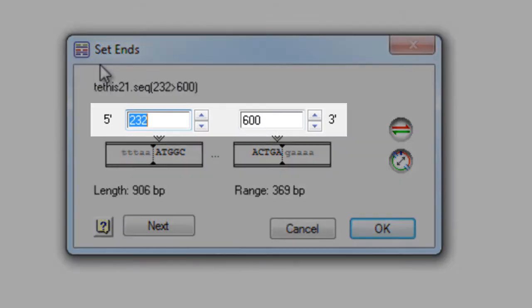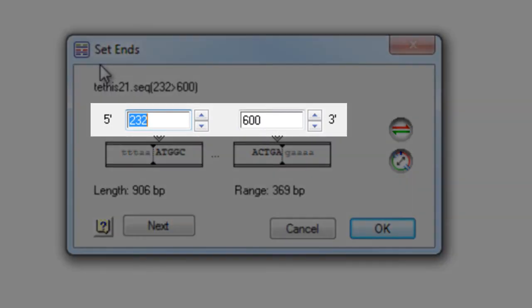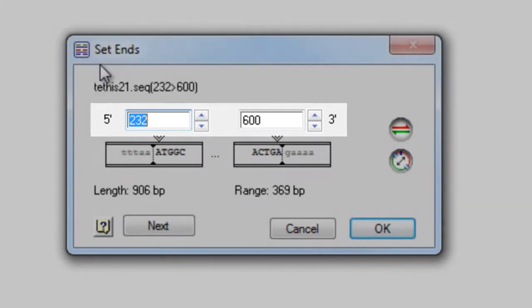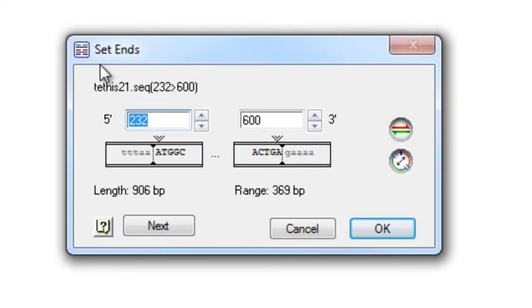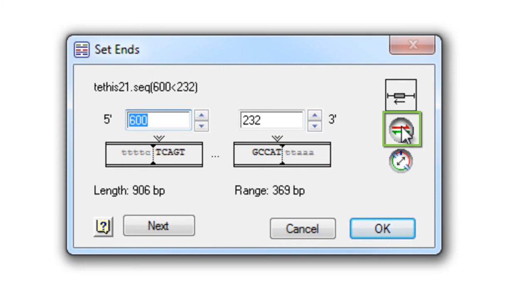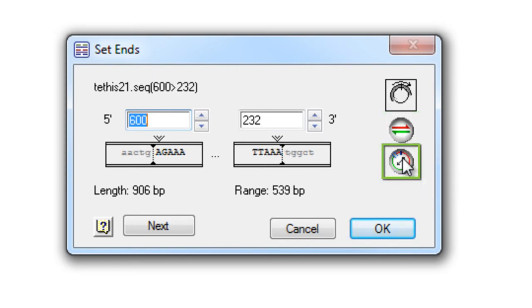In this dialog, you can type in the 5' and 3' coordinates you want to use for the sequence ends. Here, you can also elect to use the reverse complement of the sequence, or the inverse sequence, which is useful for circular sequences where the range crosses the origin of replication.